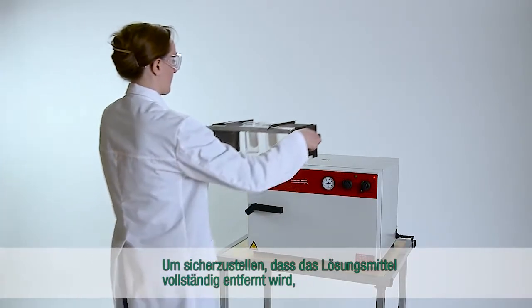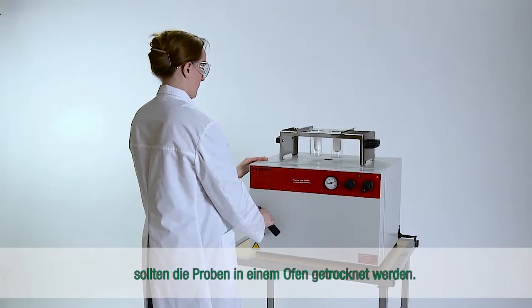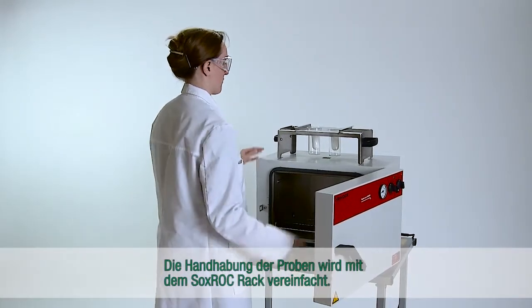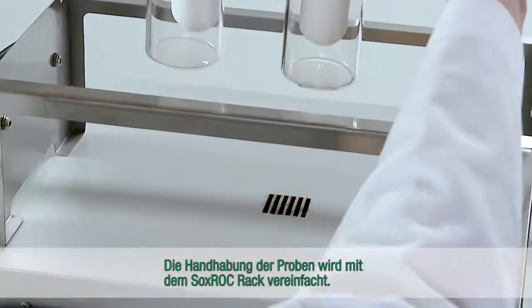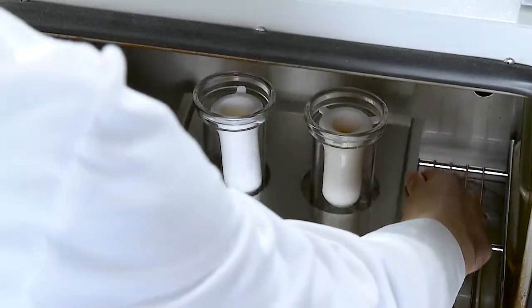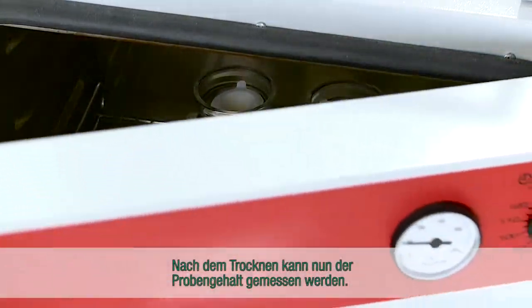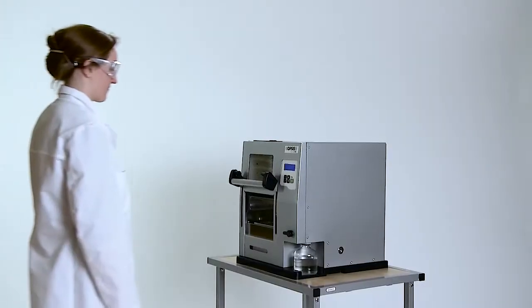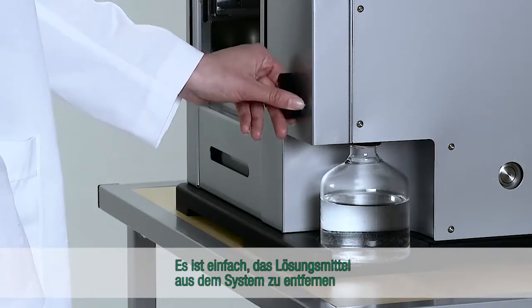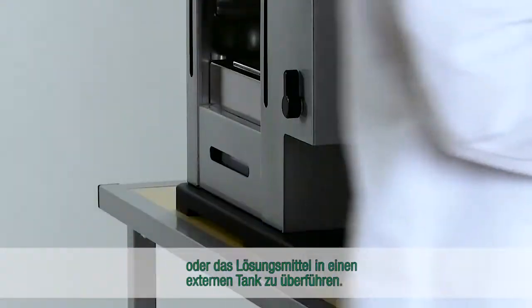In order to ensure that the solvent is removed, the sample should be dried in an oven. The handling of samples is simplified with the Soxrock rack. After drying, the content of the sample can be measured. It is easy to remove the solvent from the system or to transfer the solvent to an external tank.